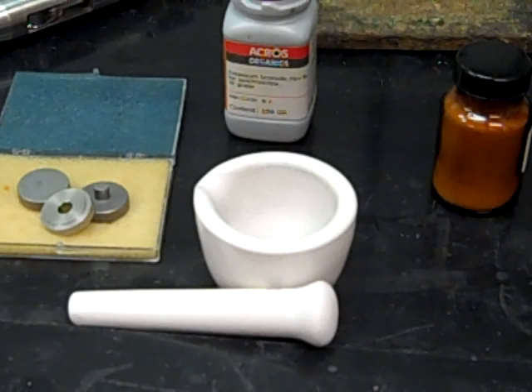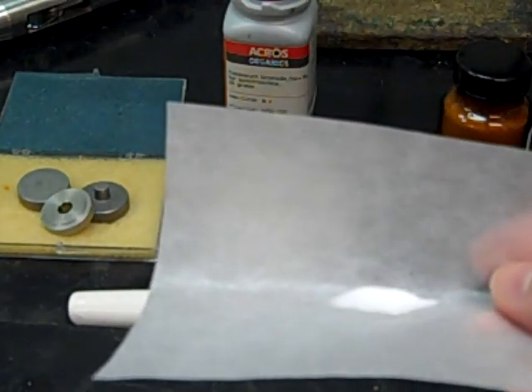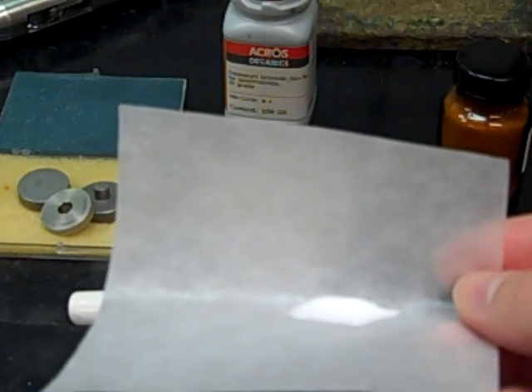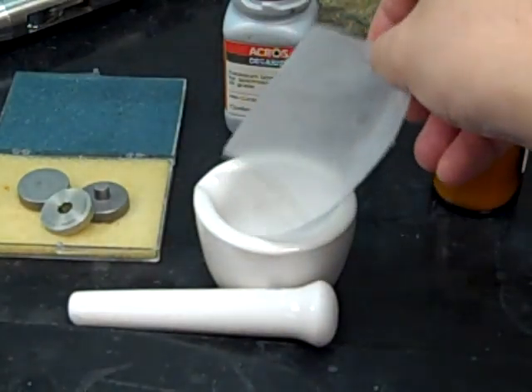The first thing you'll do is weigh out about 150 milligrams of the KBr salt. I've already done this on a weigh paper. It doesn't have to be exactly 150 milligrams, but in that neighborhood. Once you get that KBr salt, you're going to pour that into the mortar and pestle.